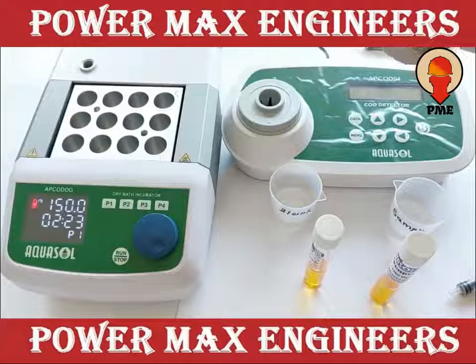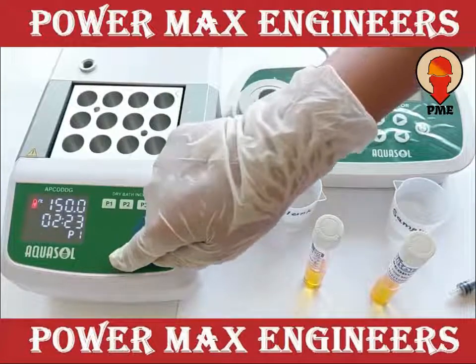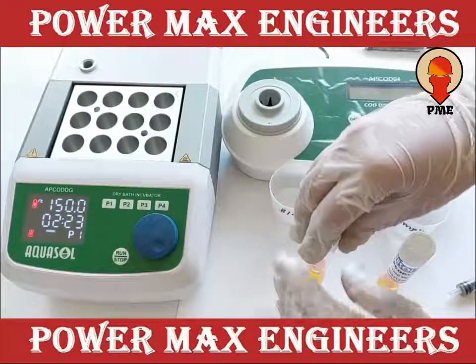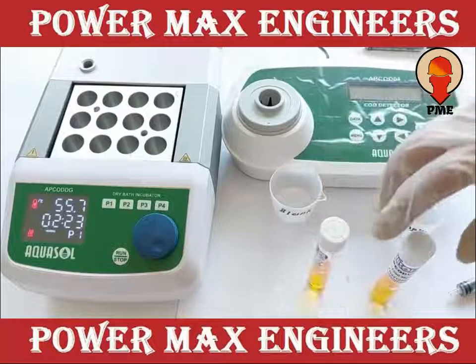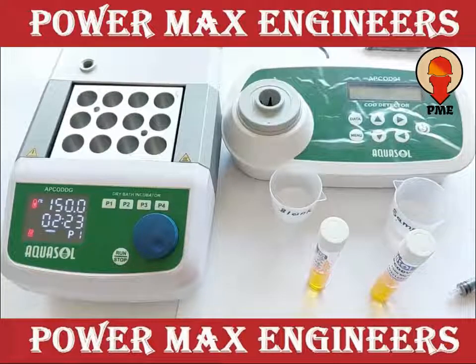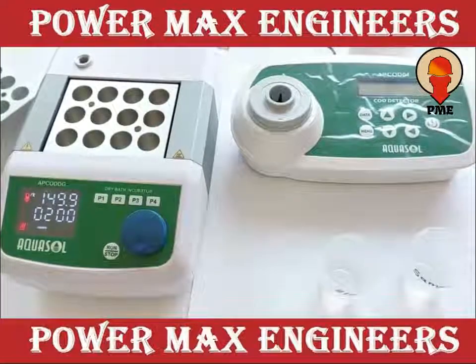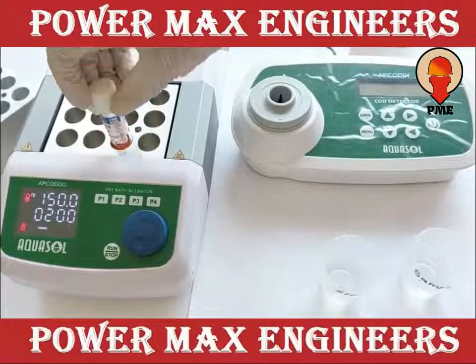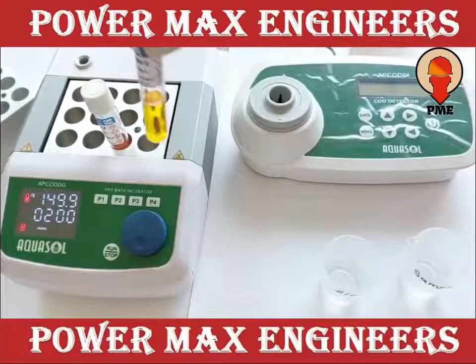Then press RUN to start the heating process and wait till the heater reaches 150 degrees Celsius and enters holding mode. Now place both the vials in the heating block. Digestion procedure is started.